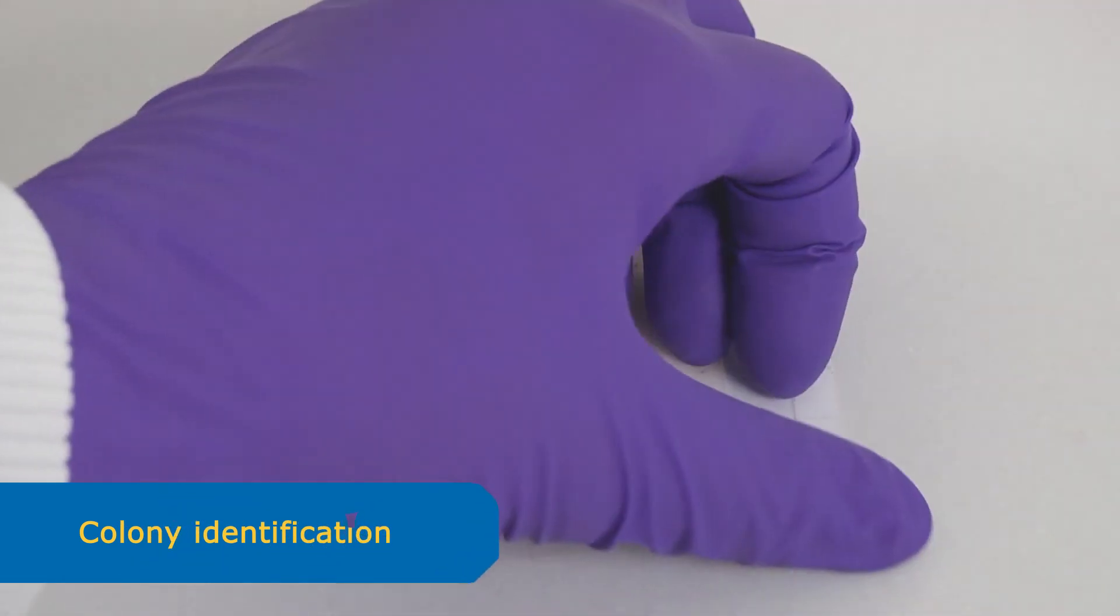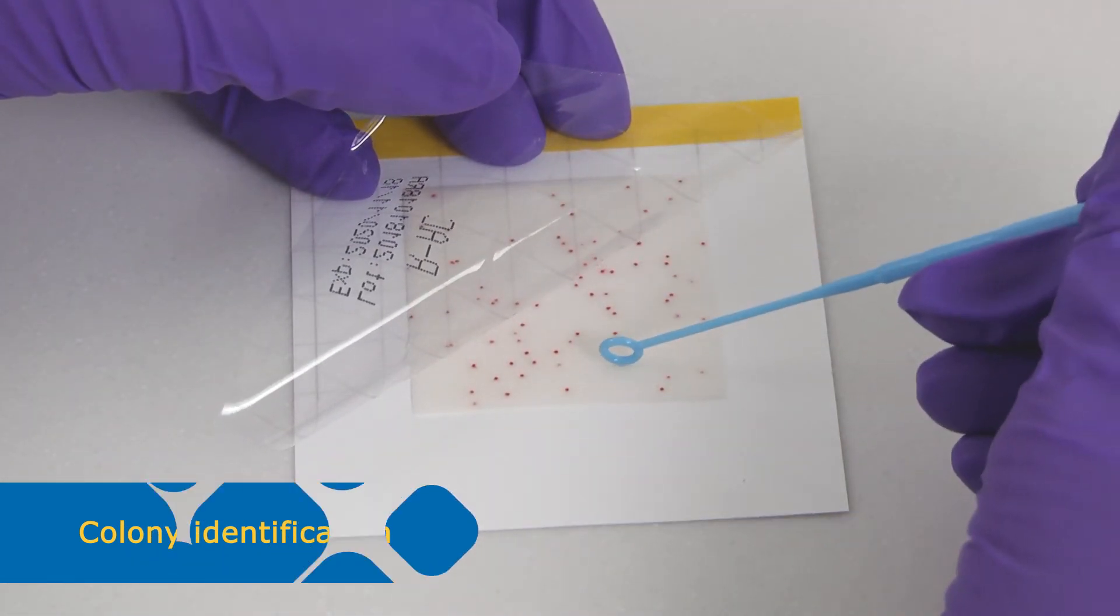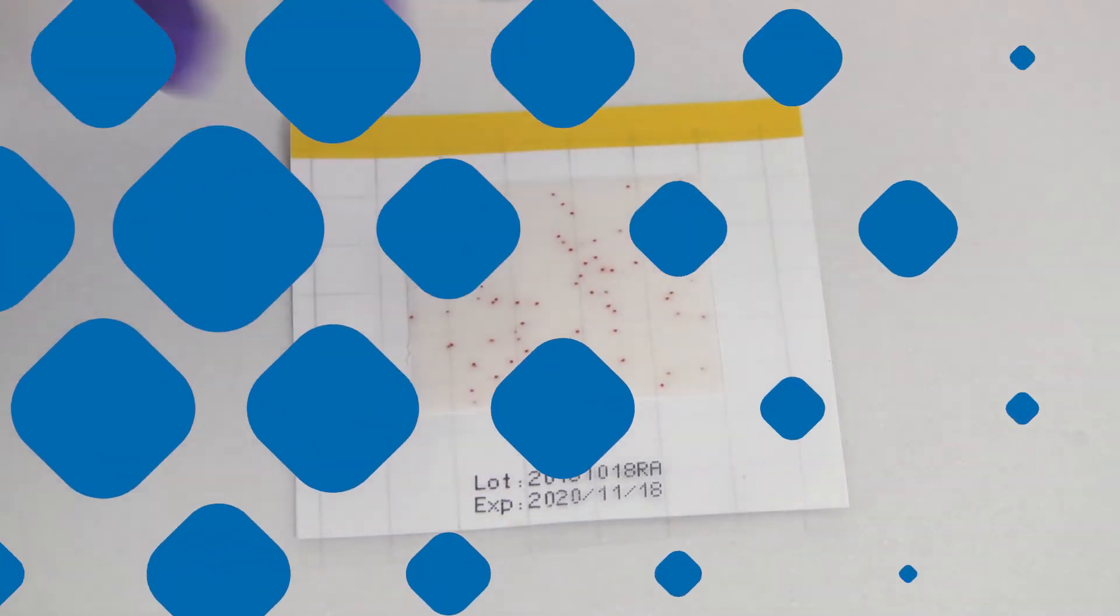For identification, you can pick up a colony using a sterile needle by scratching the pad. The pad will remain stained.